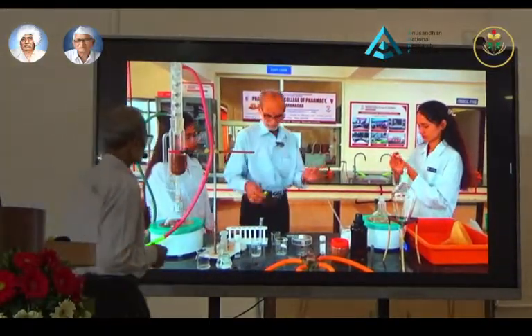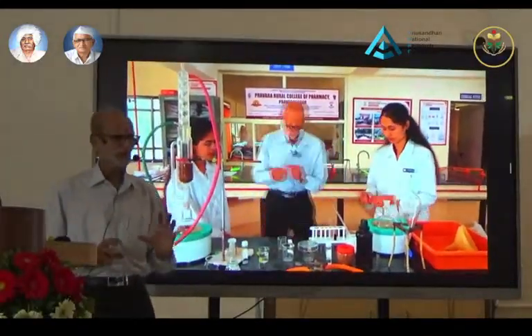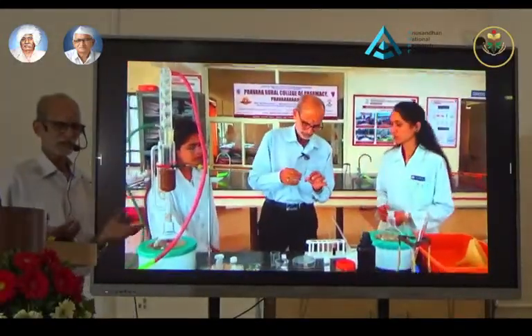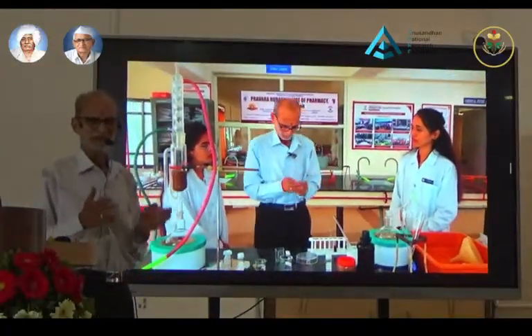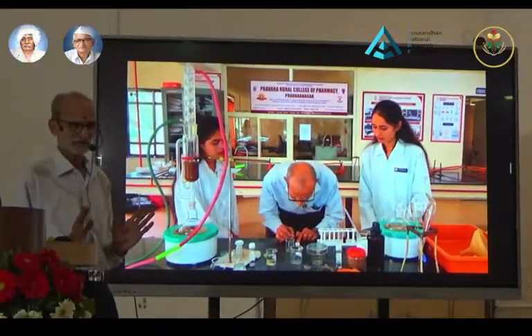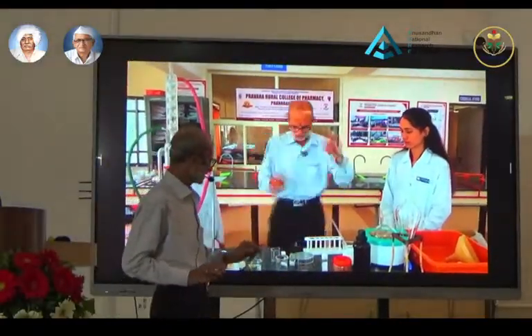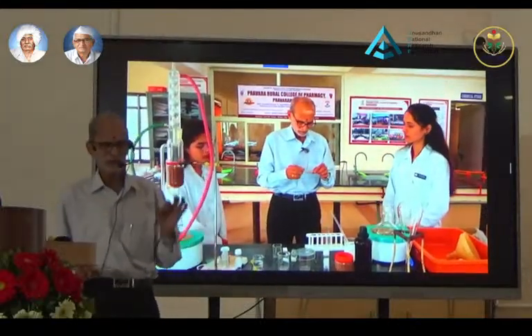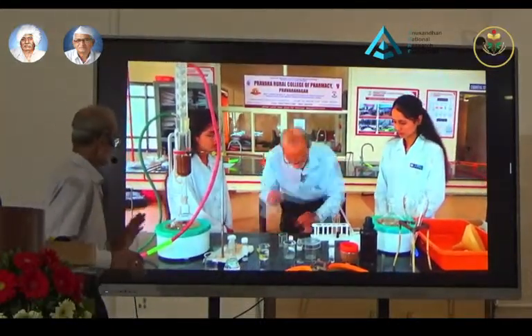Okay, so in this particular case, we are trying to demonstrate that, as I told you, whenever you undertake extraction and isolation, first confirm that the raw material which you have bought contains the desired constituent. Most important thing. Without that, do not proceed. So here we are trying to ascertain that the powder contains quinine with the help of TLC.